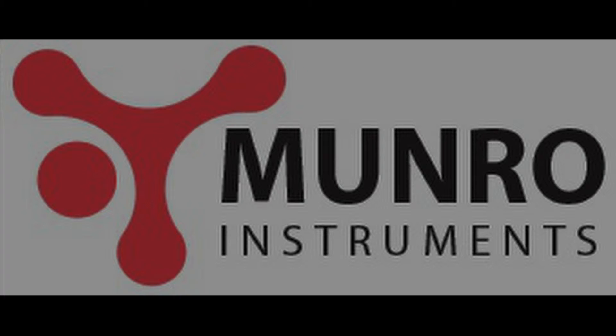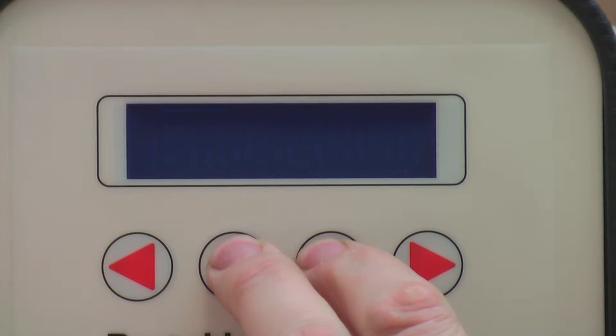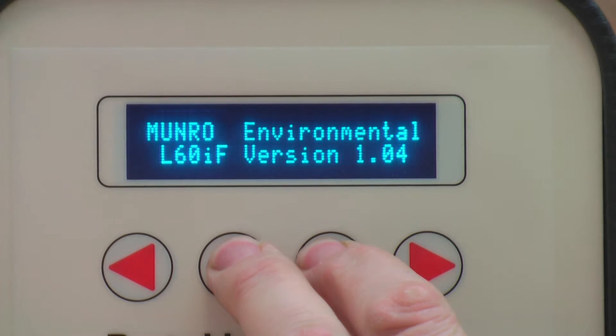The menus for the L60IF can be navigated by using the four arrow buttons on the front panel. To access the configuration menu, please press and hold the up and down buttons at the same time whilst turning on the Air Sampler. Keep pressing the button until the menu screen is clearly visible.